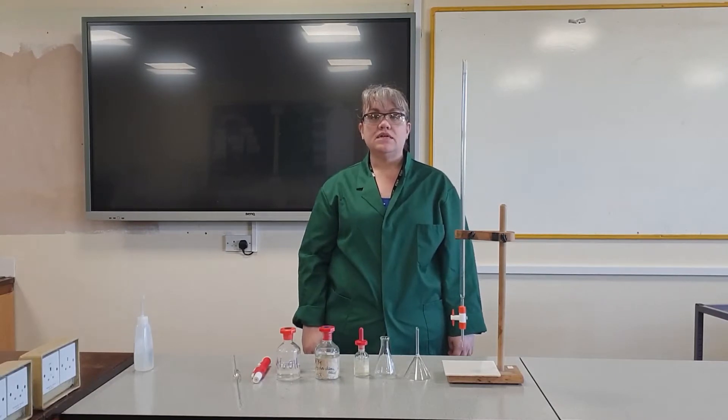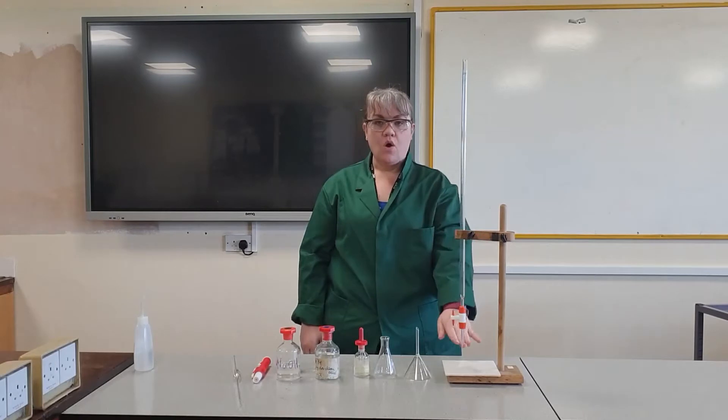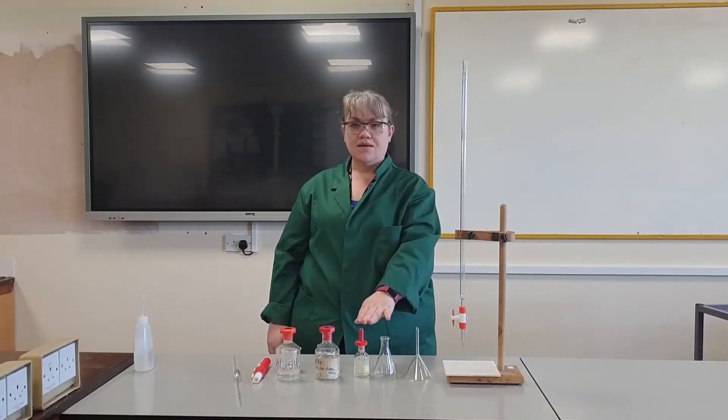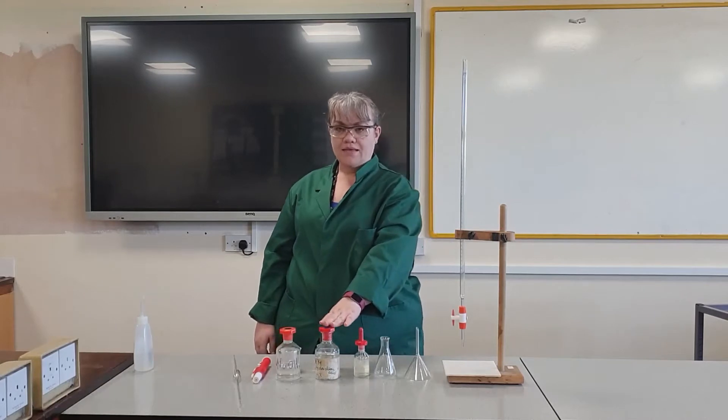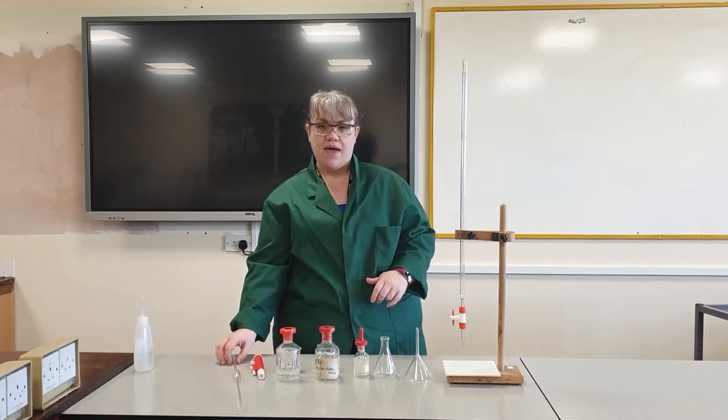The items you will need are a burette, a burette holder, a white tile, a funnel, a conical flask, indicator, acid, alkali, a pipette filler and a pipette.